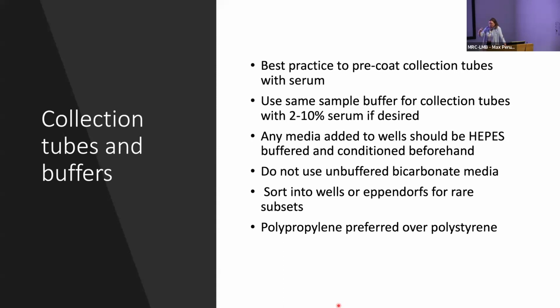And sometimes if someone brings polystyrene and they really don't have polypropylene, as the tube is filling up and getting closer to the top surface, if you imagine you have several different tubes of different populations which are not very far from one another, that buildup in charge can actually cause jumping drops to go in and contaminate. So we tend to not sort all the way to the top. We'll stop at a certain point to give a bit of buffer so that we mitigate that.